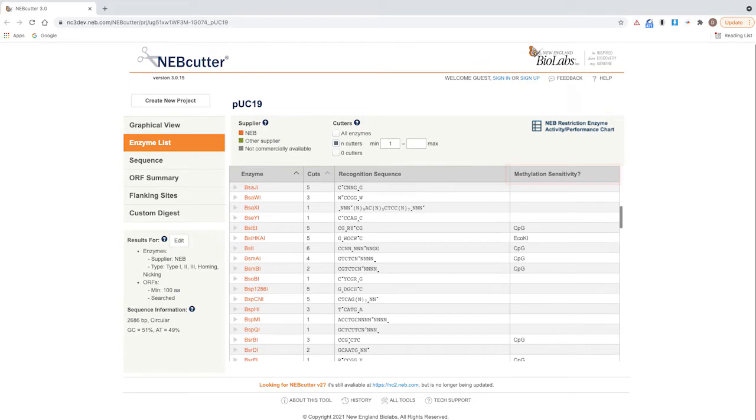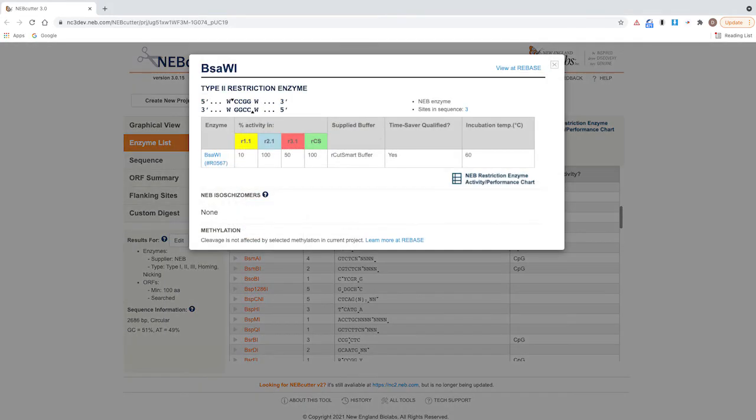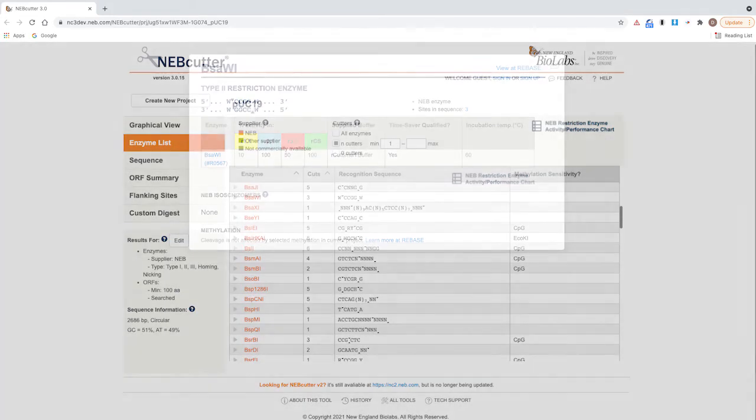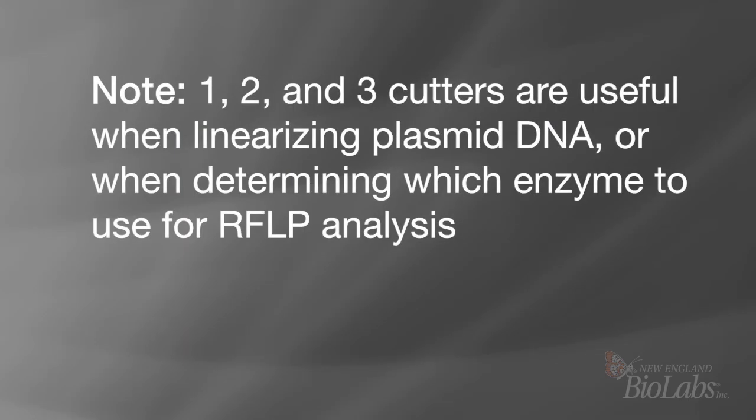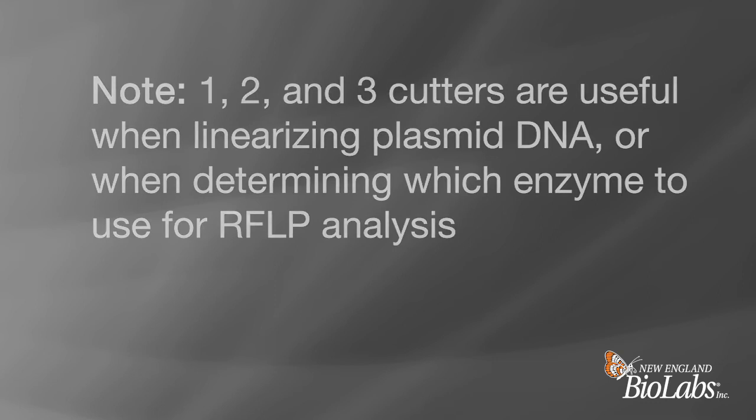Note one: one, two, and three cutters are particularly useful when trying to linearize plasmid DNA or determine which enzyme to use for RFLP analysis.